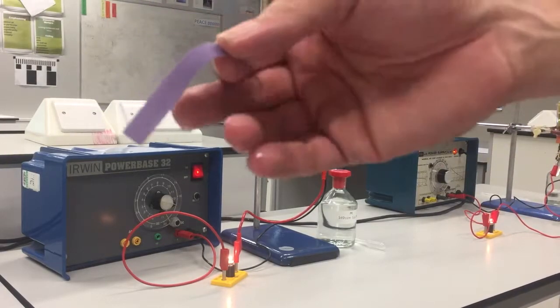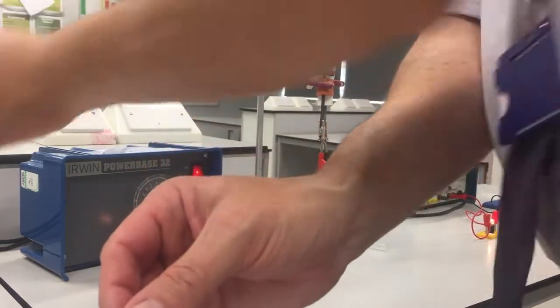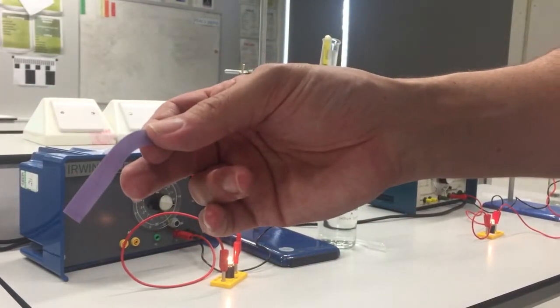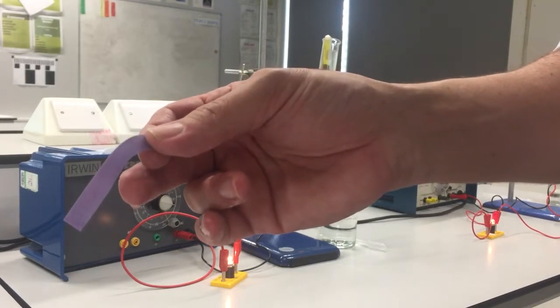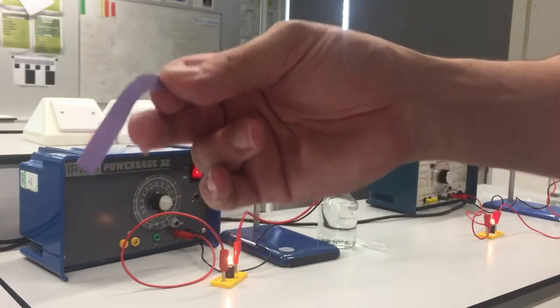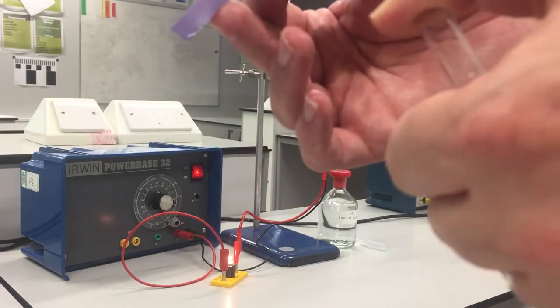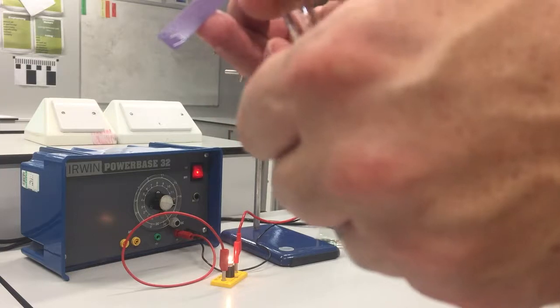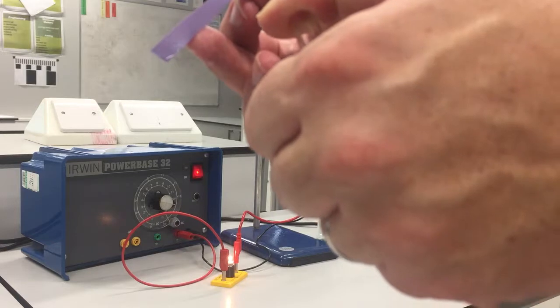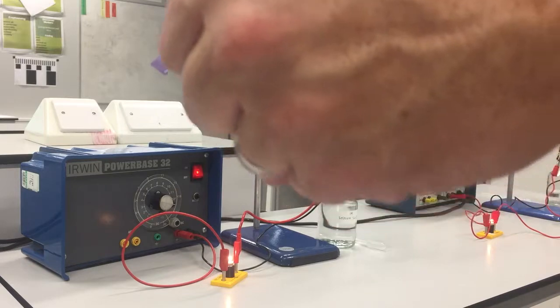Okay, so we're just going to do the gas test here. We've got some blue litmus paper, and we're just going to turn off our power pack. And then we're going to take our chlorine. Chlorine's heavier than air, so when you take it out, you should put your finger over the top as quickly as possible to make sure the gas doesn't escape. And then we'll basically just pour the gas out. The gas will diffuse out, and it will turn the paper red as the chlorine reacts with the water to form hydrochloric acid, but then it eventually will bleach the colour from the paper completely.